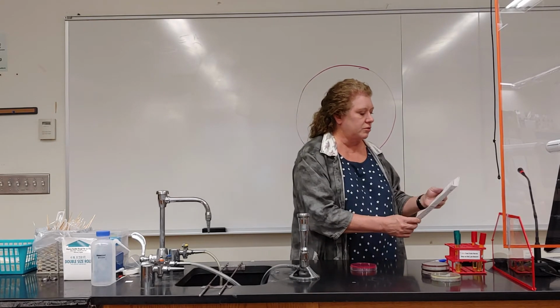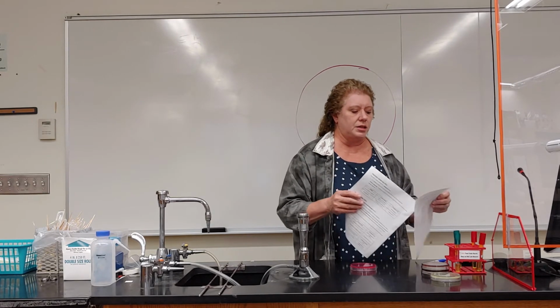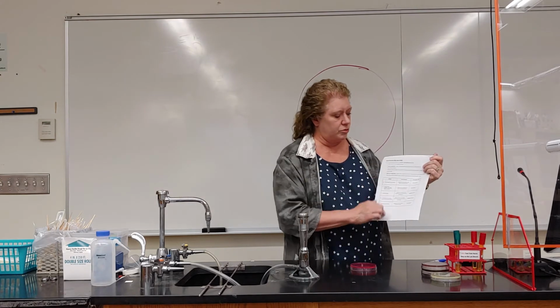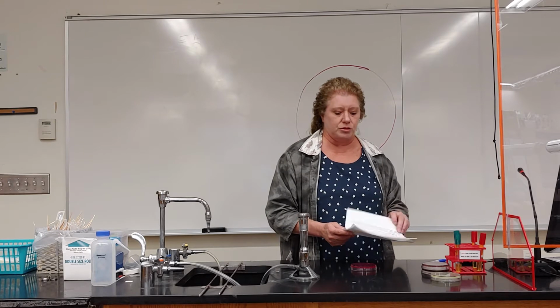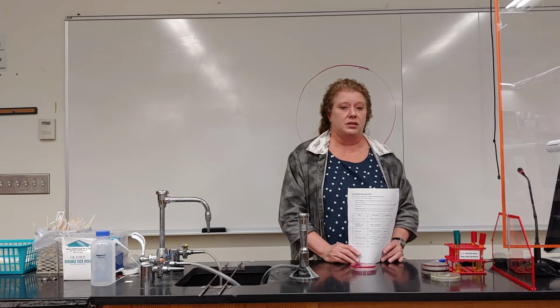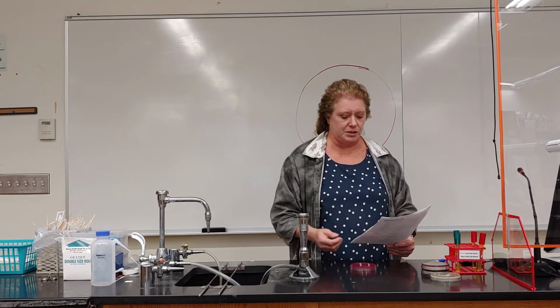And then this handout goes on to explain the MacConkey agar in the same manner, and EMB in the same manner. There are tables for each of them. So you should make sure you familiarize yourself with these tables. You're going to be using them to read the results on plates in the future, especially on quizzes and lab exams. You want to be able to reference this information quickly and understand what it means.